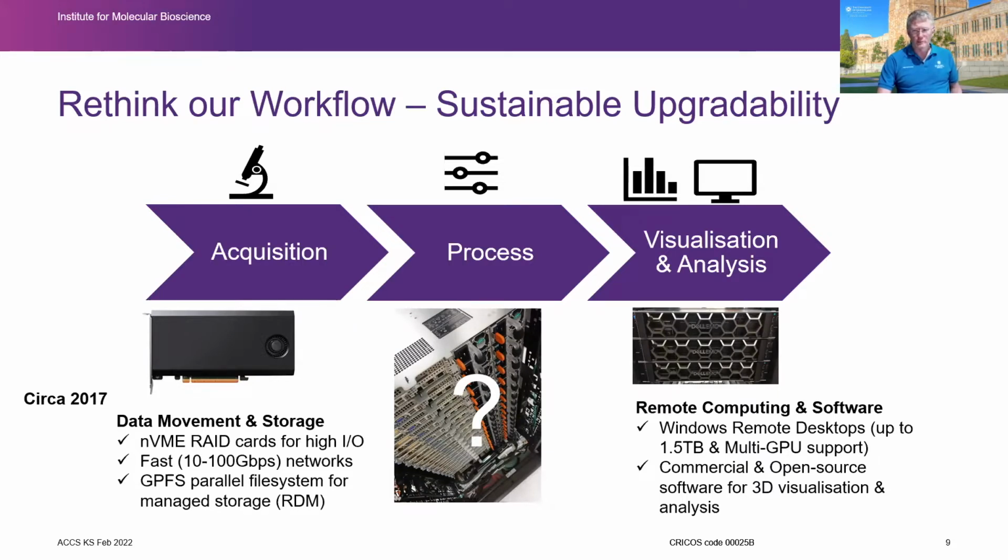To do this, we chipped away at the problem by approaching it from different angles. Acquisition PC hard drives were beefed up to higher I/O NVMe RAID drives, and we also installed faster network cards. We installed fast backplane switches in our building to allow us to move data onto our new local GPFS cache, which also then automatically populates the other caches on campus to allow us to move the data to different resources.